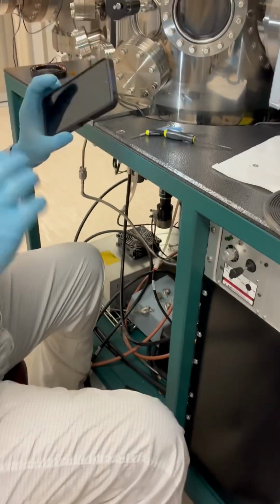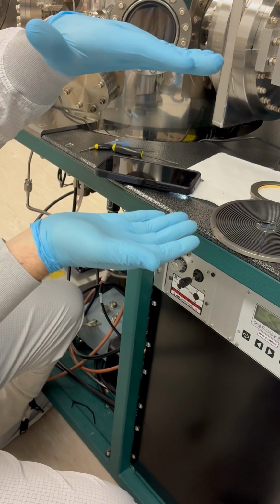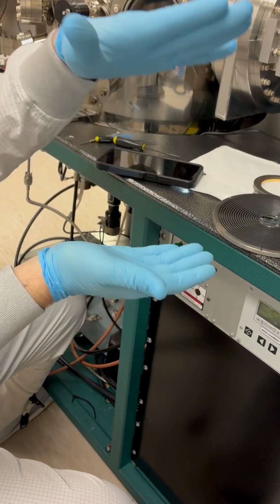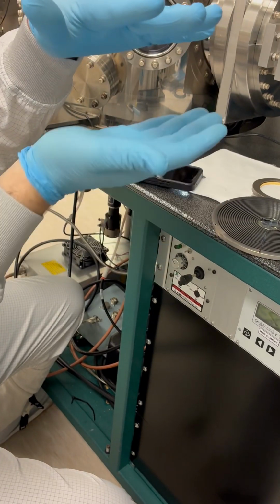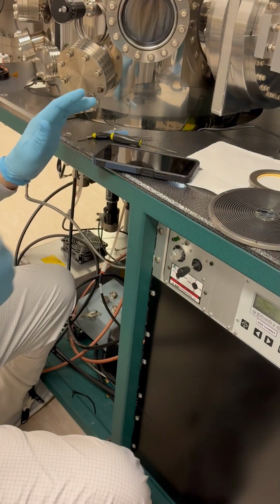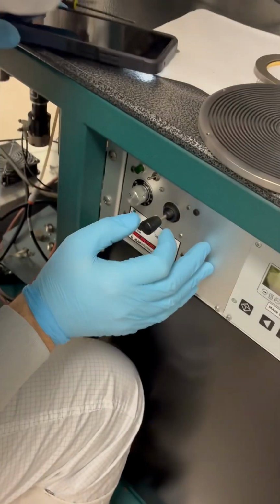So I've pushed it down, and I've noticed that the gap between the sample holder and the stage has closed up a little bit. That tells me that some of the sample holder's weight is now being supported by the transfer arm. And so I'm going to stop and try to rotate it into position, right? I'm only going to go in the counterclockwise direction.